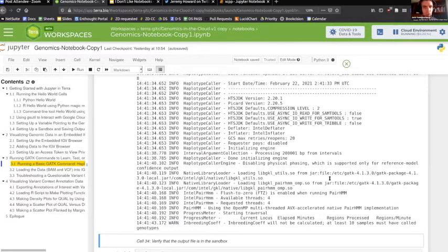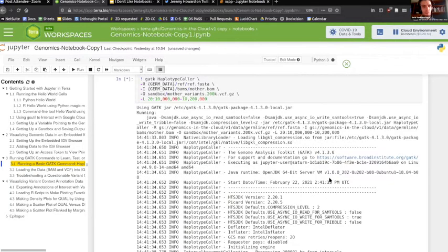I personally like very much having this aspect of command line utilities running in the notebook and dumping all of their output, because if something goes wrong, you can easily save the notebook and then send it to someone else to have a look. And I find this also very, very useful for diagnostic purposes.